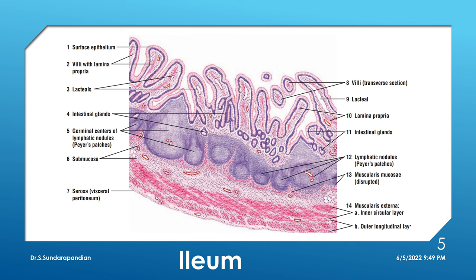In the lamina propria you can make out intestinal glands called crypts of Lieberkühn, similar to jejunum and duodenum. Also in the lamina propria are numerous lymphatic nodules called Peyer's patches. Sometimes, if there are more numbers of lymphatic nodules, they may extend into the submucosa by penetrating the muscularis mucosa.